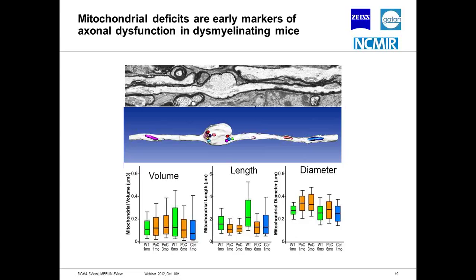And this was a data set that they collected overnight, and they were able to generate hundreds of models, and so it had enough numbers to generate meaningful statistics. And I think that's what's been largely missing when you look at 3-dimensional electron microscopy. People make these pretty models, but pretty models don't get us published. We need hard numbers.